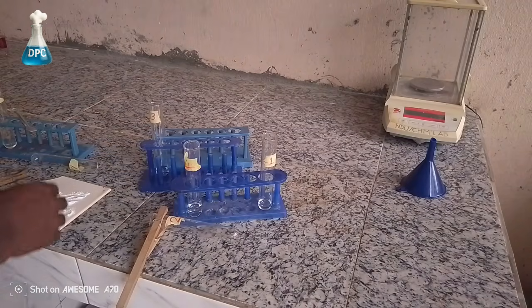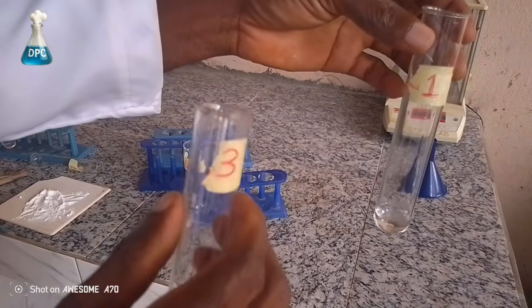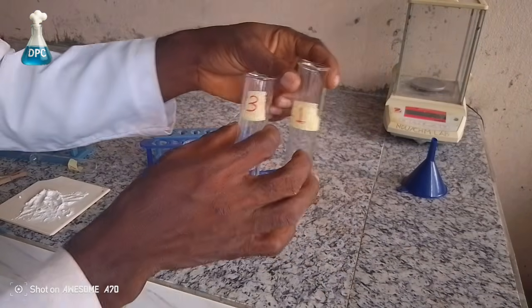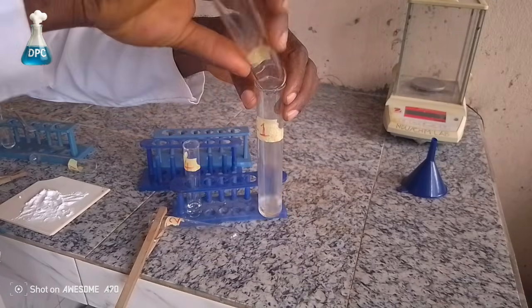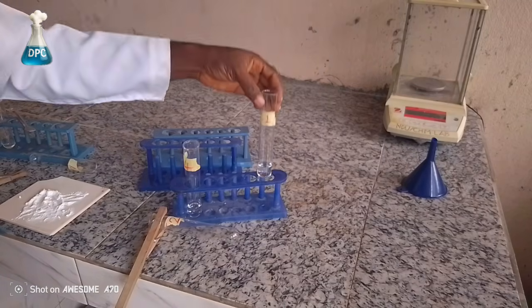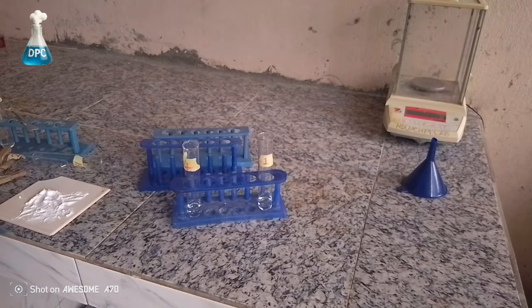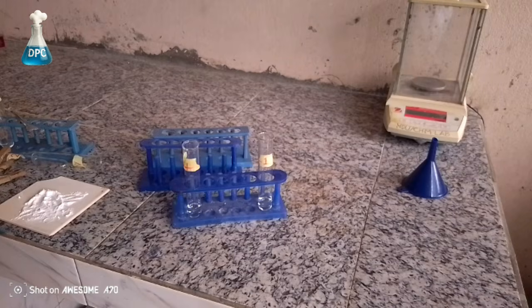Now we can take test tube 1 and test tube 3, which were not heated. Now they are at room temperature. We can react them and observe their effervescence. Now you can see the rate of bubbling. Compare with test tube 2 and 4 that were heated. You can make your judgment and conclude which of them has faster rate of reaction.